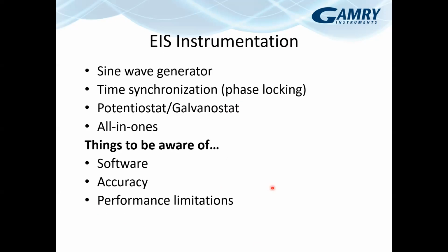So that was kind of how the EIS works in terms of the electrochemistry and how it applies to your cell and what you're actually going to do. But, and I started to note this with the Kramers-Kronig Transform, instrumentation is actually relevant when you take an EIS measurement. For a lot of DC electrochemistry techniques, the instrument is present, it determines some of your limits, but it is not as large a factor in the response that you're seeing as it can be with EIS.